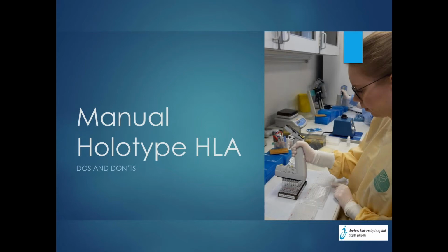And in one single instance last summer, we had a dropout of the C loci due to some problems in the lab. And they thought, okay, let's do Sanger sequencing of those loci because we know how to do that. But it turned out to take so much time and so much reflex testing that they ended up doing NGS anyway, once again. So they are getting really used to it and seeing that it made the time much better. So at this point, you could say we were ready for automation.